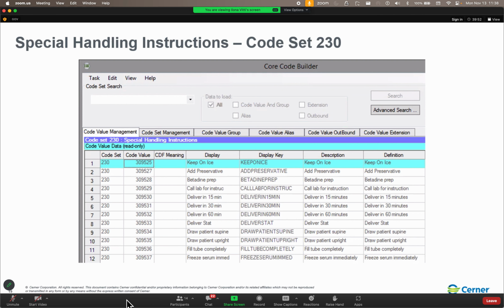Now, let's see what we see in here. We can see the specimen types. And the reason why I love Collection Requirements Inquiry, and I love it even better than just going into colrecmate, is I can see all of the specimen types associated with an order on the same screen.